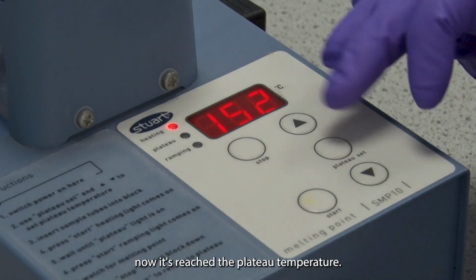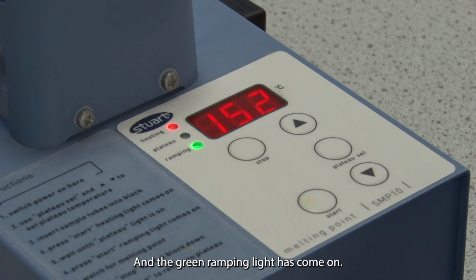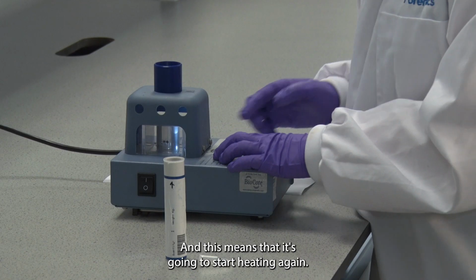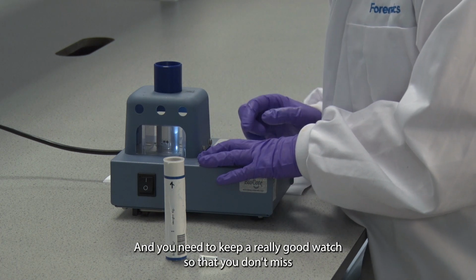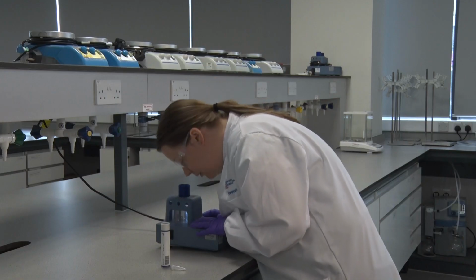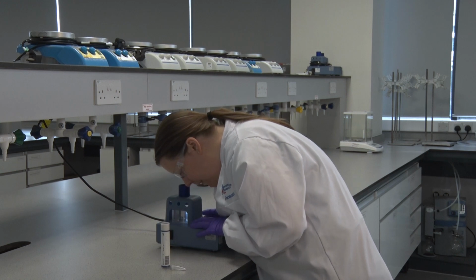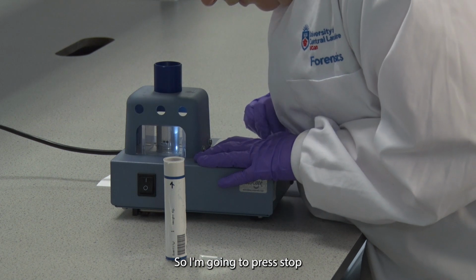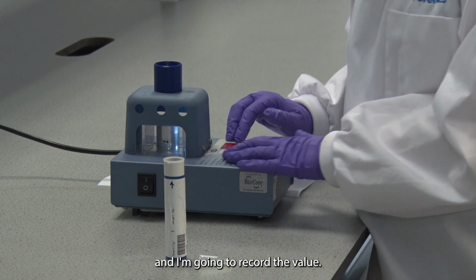So now it's reached the plateau temperature, I'm going to press start again and the green ramping light has come on, and this means that it's going to start heating again, and you need to keep a really good watch so that you don't miss the melting point. Right, and now it's starting to melt. So I'm going to press stop and I'm going to record the value.